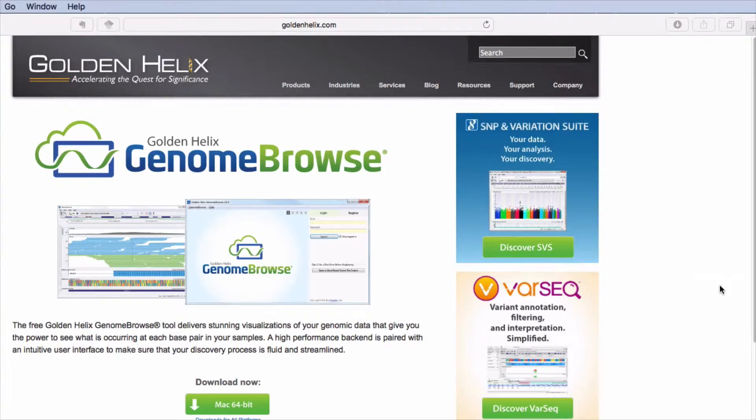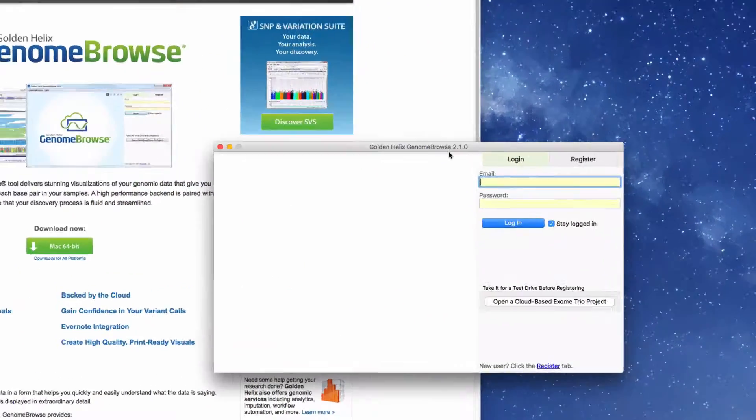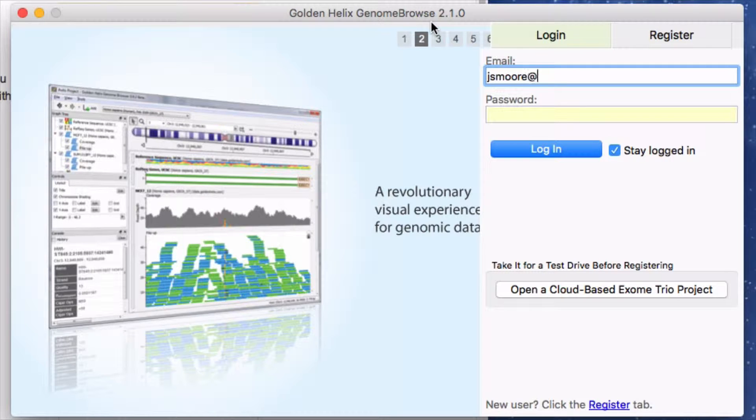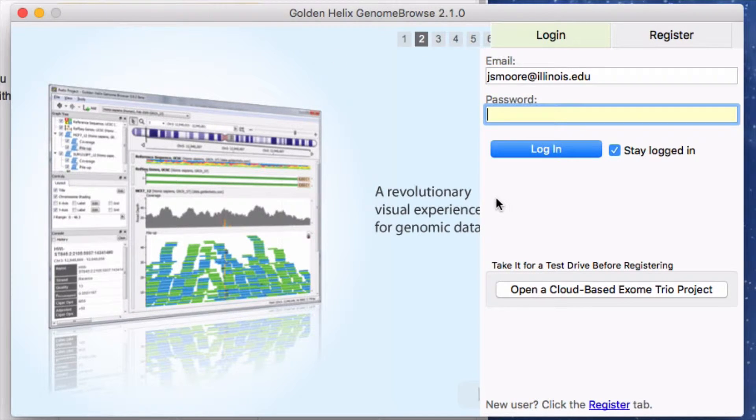You will need to register with Golden Helix to use Genome Browse. To register, use the links on the launch page. After registering, log in with your email and password.